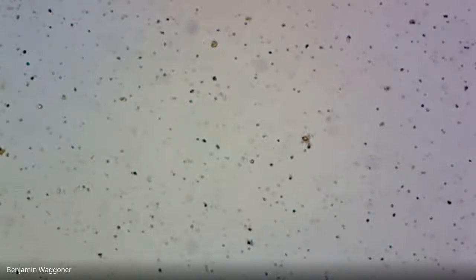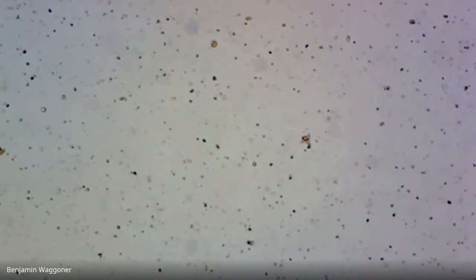Connecting. Okay, I'm starting recording. This is the last sample. This is from the Prairie. So let's see what kind of worms we've got on UCA's Prairie.